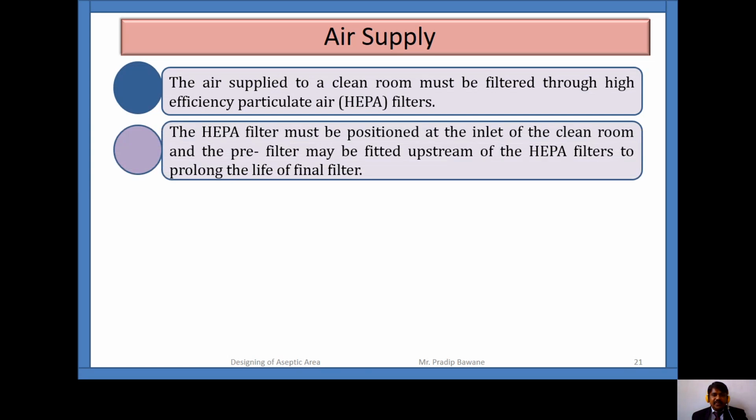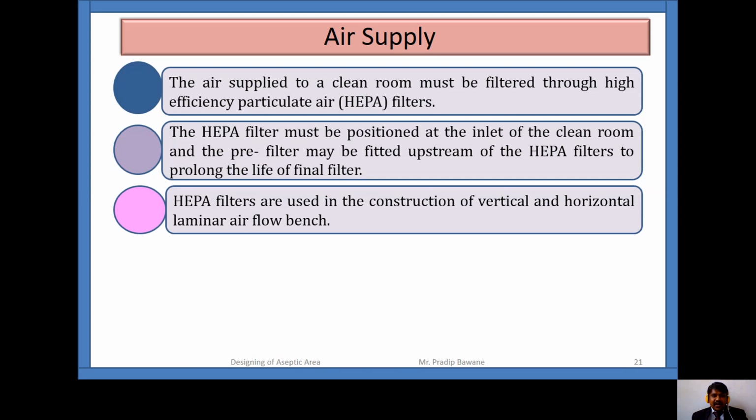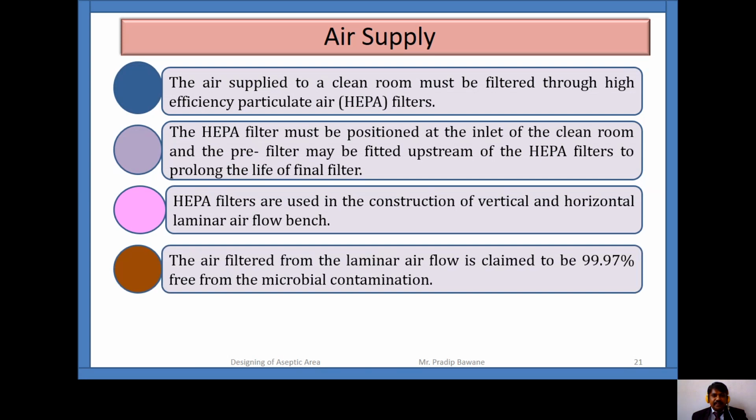The HEPA filter must be positioned at the inlet of the clean room, and a pre-filter may be fitted upstream of the HEPA filter to prolong the life of the final filter. So whenever we are using the HEPA filter, we have to use the pre-filter so as to increase the life of the HEPA filter. HEPA filters are used in the construction of vertical and horizontal laminar airflow, which is generally used in the aseptic area.